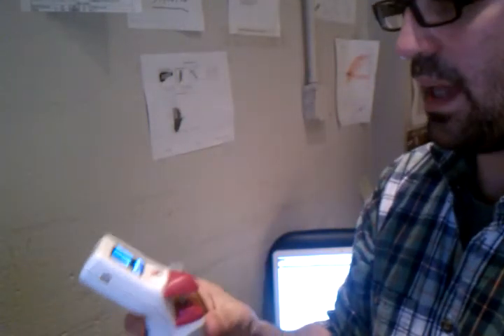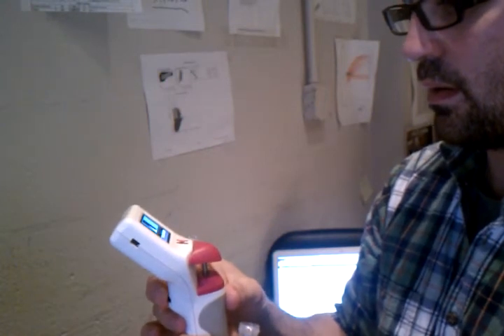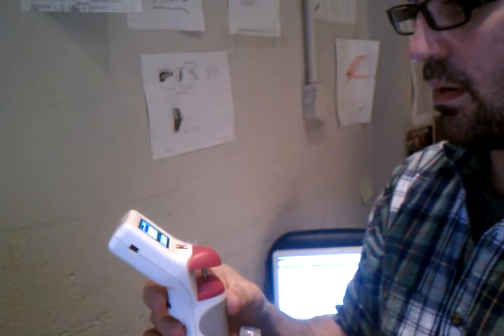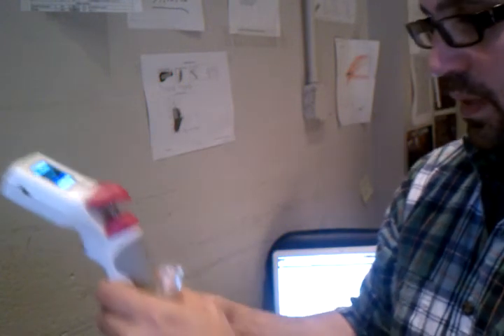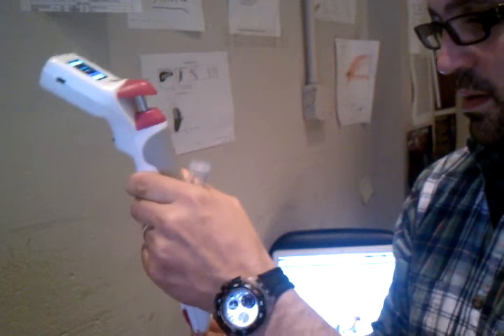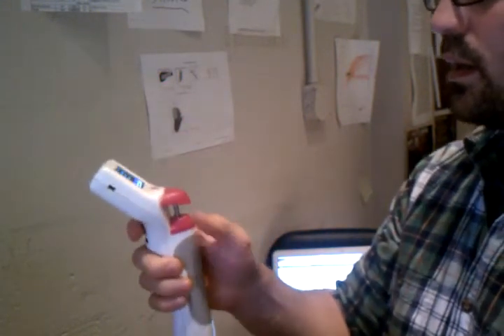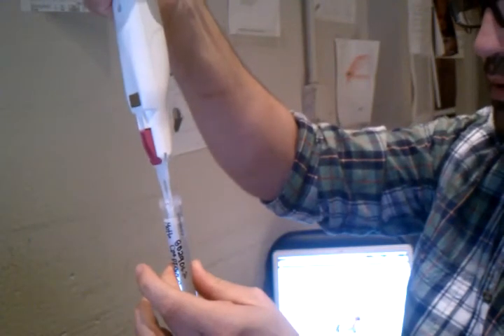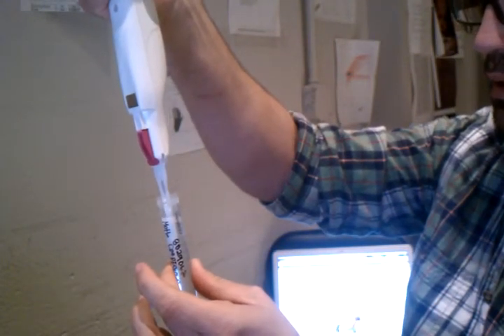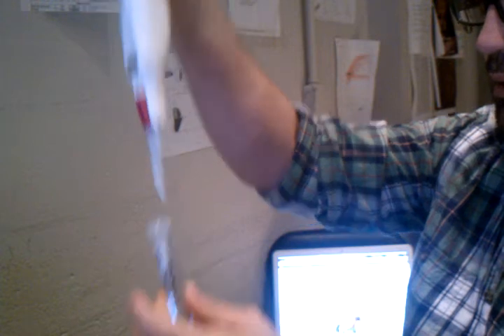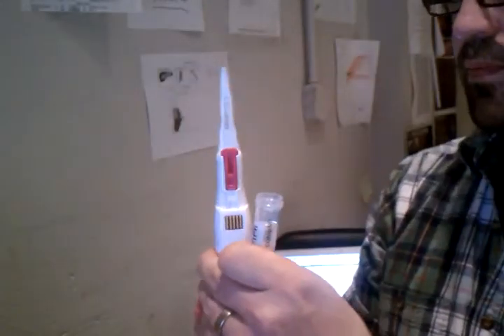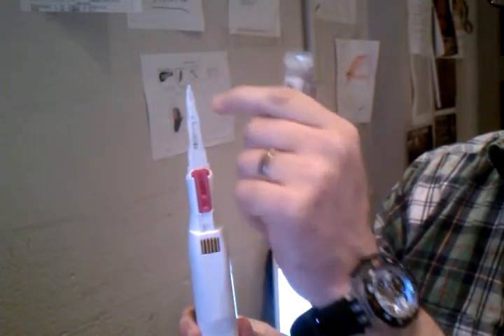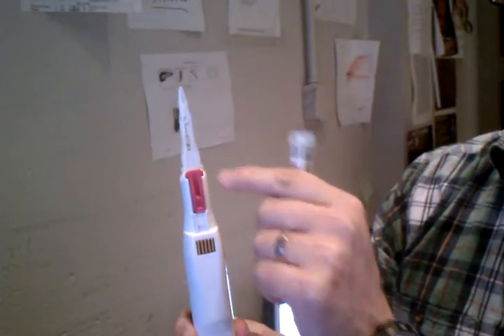So now what I've been doing is as soon as I sample, I turn it upside down. So now if there are bubbles in there, they're going to be at the top and not be taken into the chamber here.